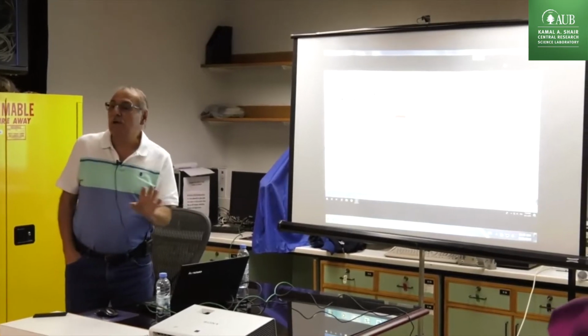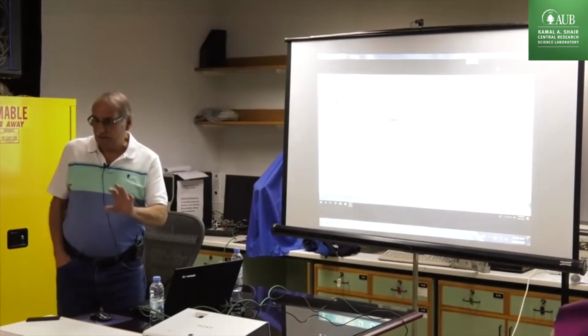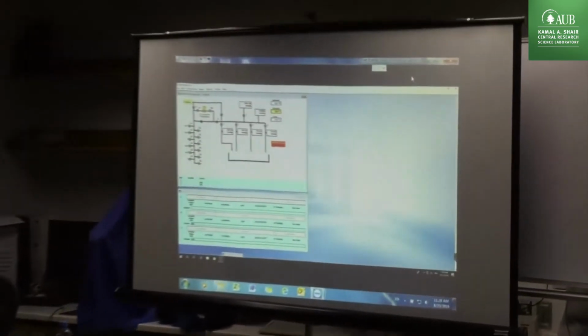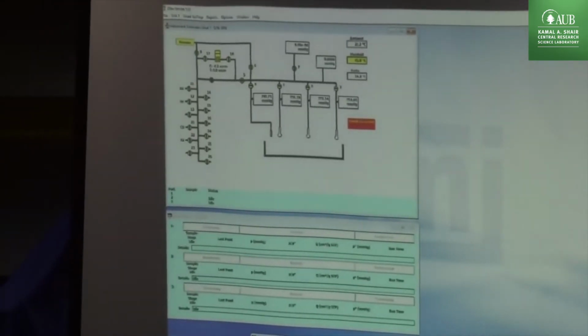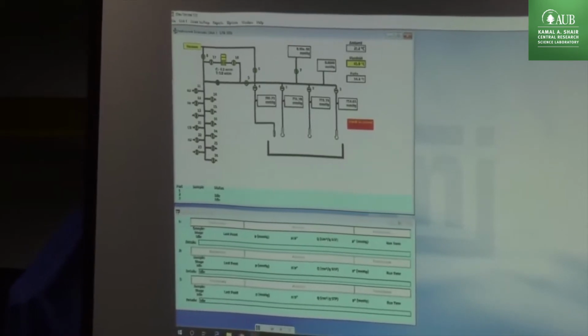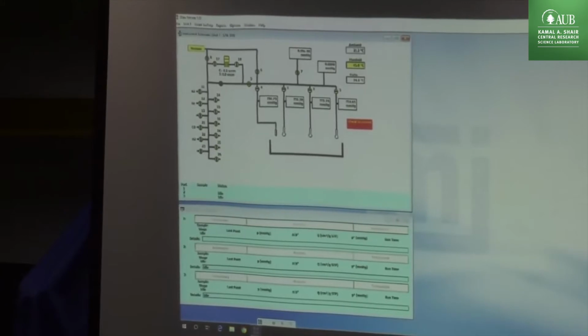And see how we can select the correct limits for the BET surface area and everything. It is so easy with the program, with the system. It's so easy to adjust the limits. You don't have to make any calculation. You will see, you just adjust the limit on the screen, and automatically the new numbers come out. So I'm going to show you first.